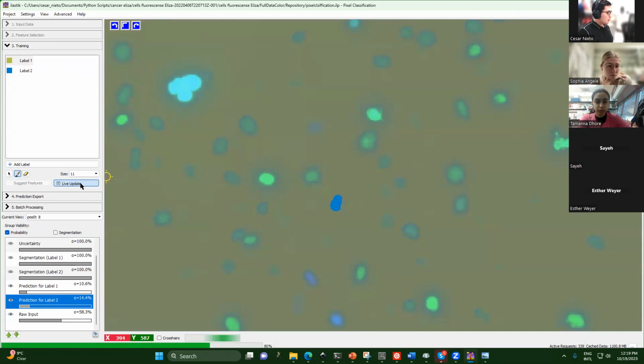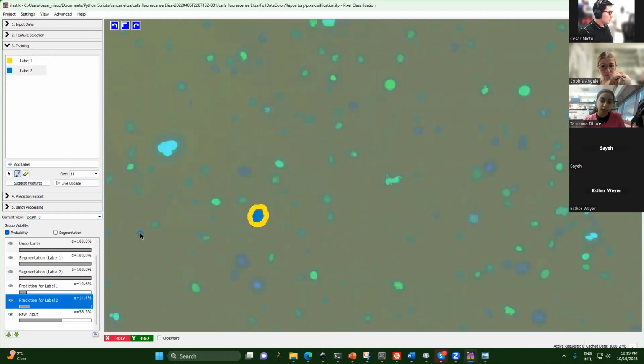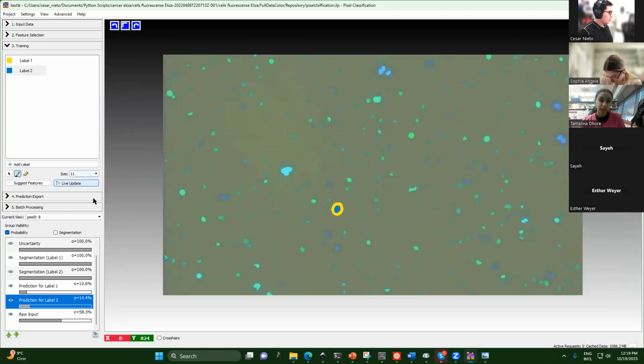I'm going to click out and click live update again. Every time live update is running, it is going to train, but sometimes the input is so high, or there are so many inputs, that the computer is going to take a lot of time to train. And that's it. You can go to other photos and so on.